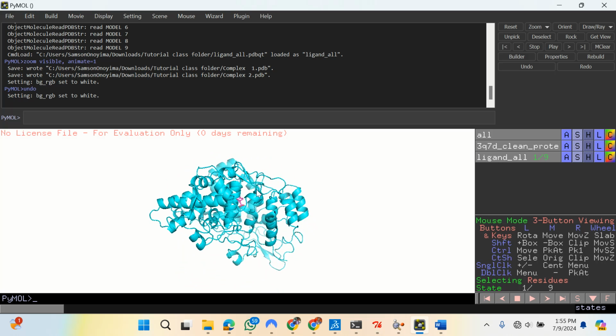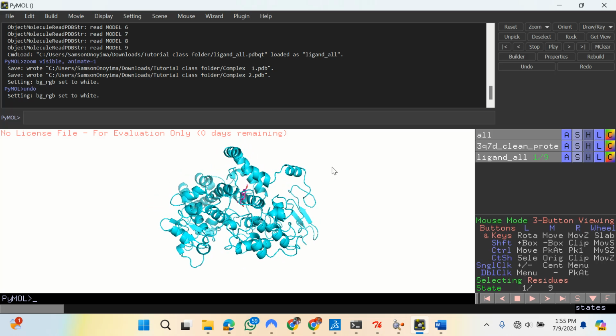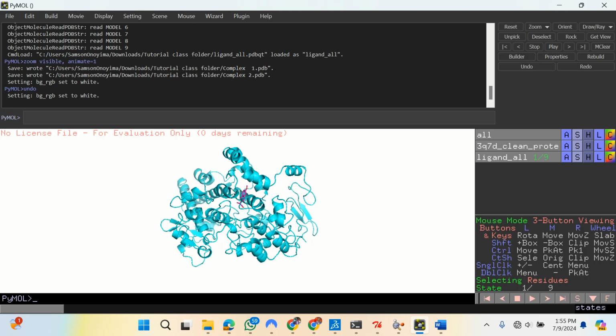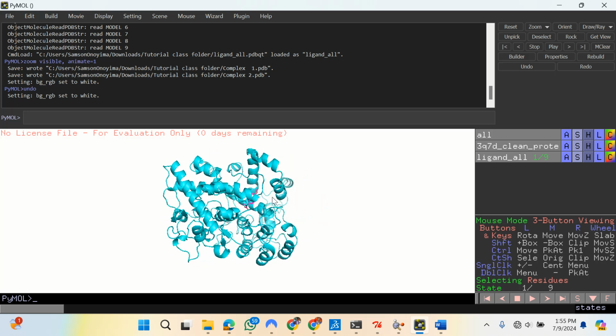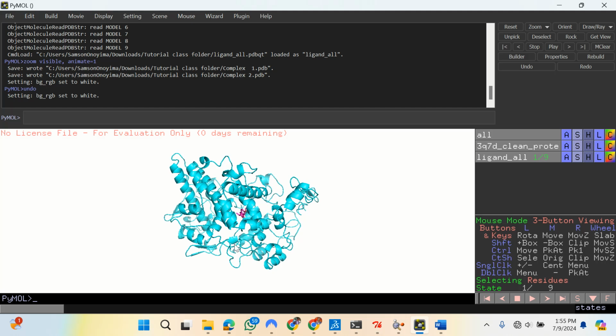Okay. I think at this point, oh well, let's still continue. So this is what we have. So I was telling you that this is already a 3D view, right? But this is a ribbon view, okay? Or rather, yeah, a ribbon view of our protein. Okay, so there's another little interesting kind of 3D that I usually use for my interactions.